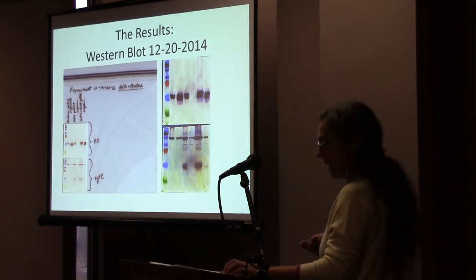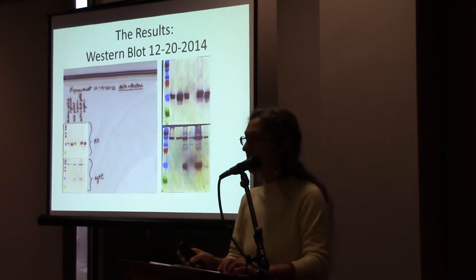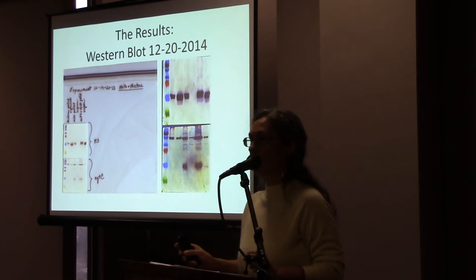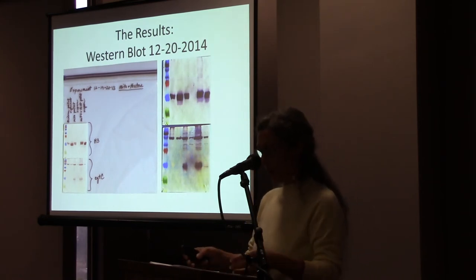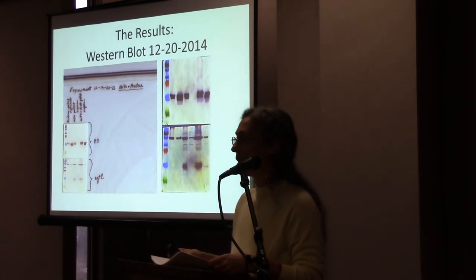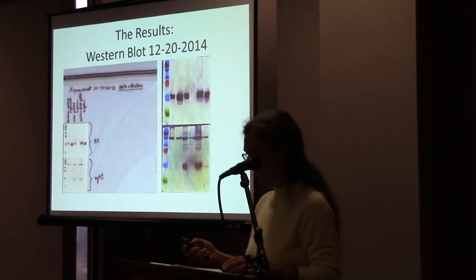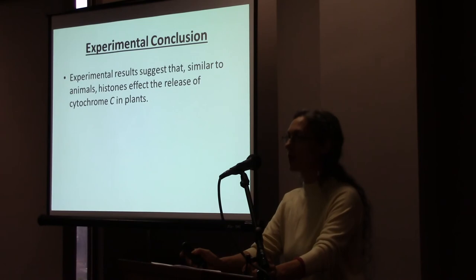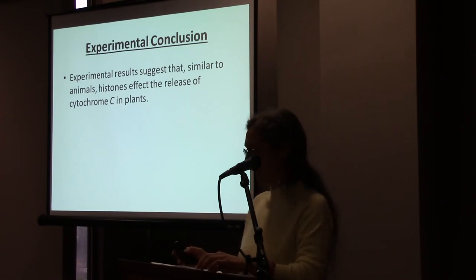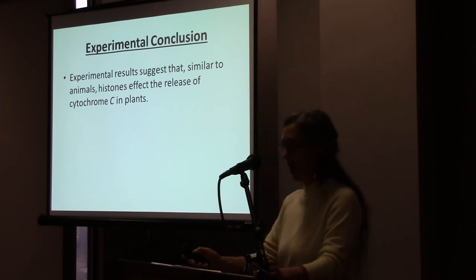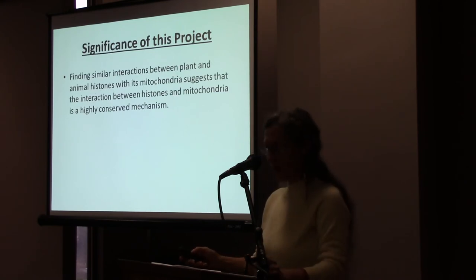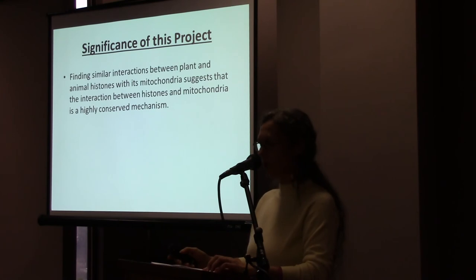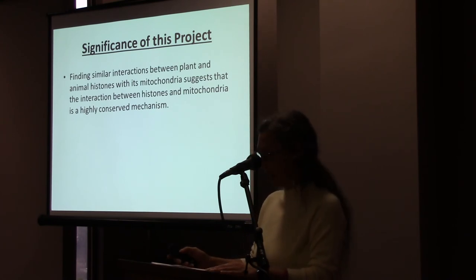The faintness of this band is simply due to the supernatant being so dilute. In fact, in the Cascone study they also ran across the same problem and attempted to concentrate the supernatant to get a better visual. The results of this experiment suggest that histones induce permeabilization in plant mitochondria, causing the release of cytochrome C from the intermembrane space. The significance of this finding is that a similar interaction between plant and animal histones with mitochondria suggests this interaction is a highly conserved mechanism.